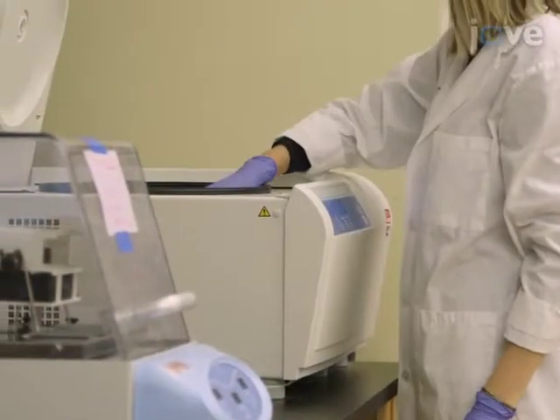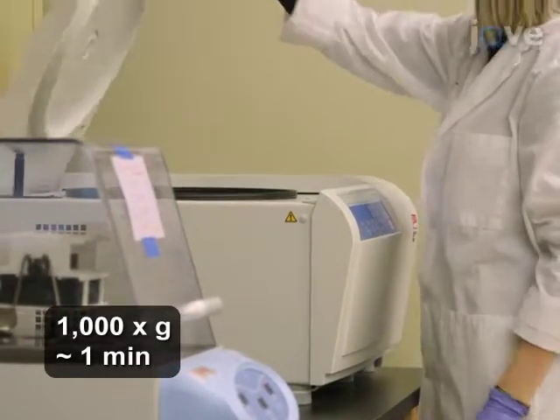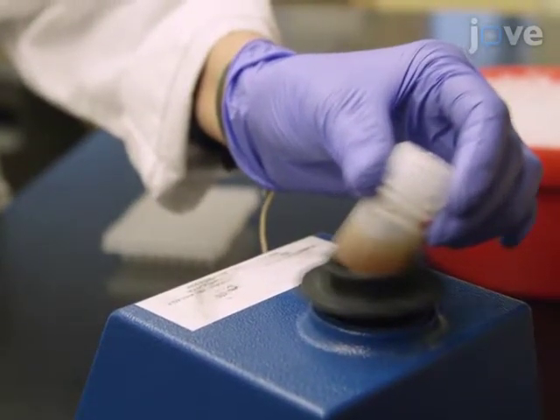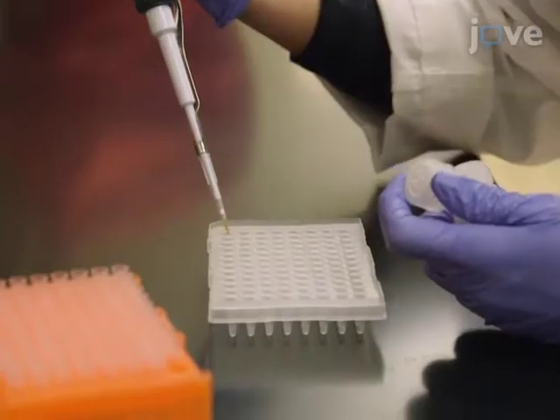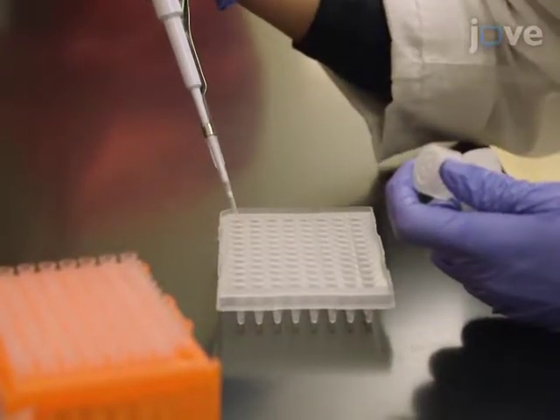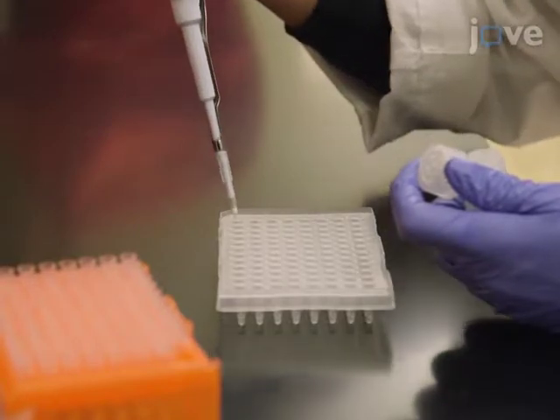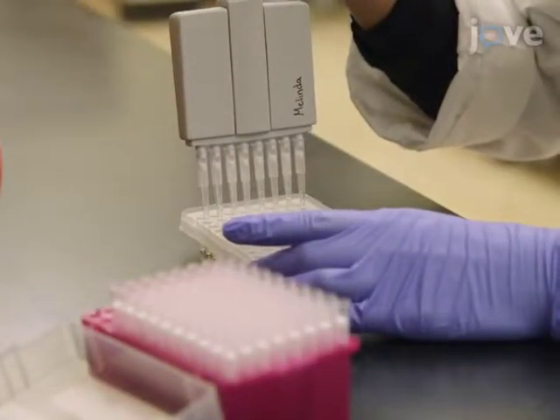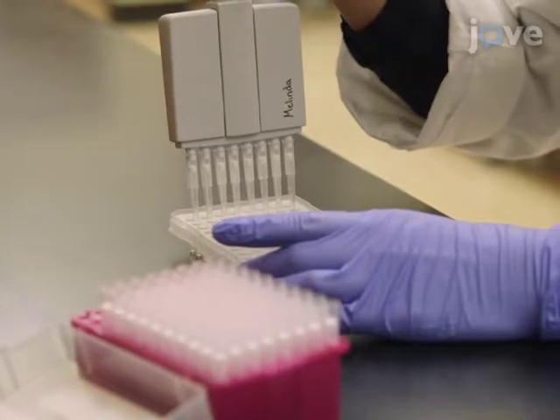For the cleanup, first briefly centrifuge the Amplicon PCR plate to pool the reaction products. Next, vortex the magnetic beads to evenly disperse them and transfer 20 microliter aliquots to each reaction well. Mix the beads with the solution thoroughly by pipetting the entire volume slowly 10 times. Then let the beads settle for 5 minutes.